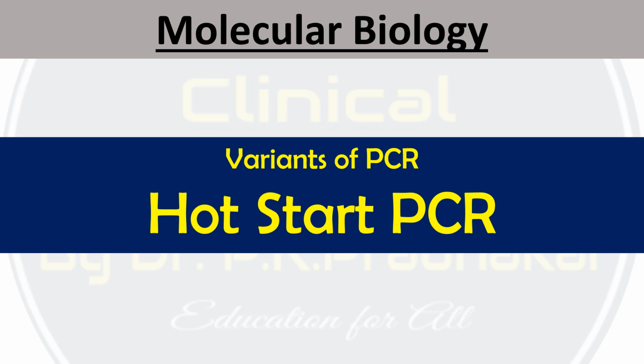In the series of variants of PCR, this is the third lecture where we are going to discuss the Hotstart PCR. We will see what exactly Hotstart PCR is and why we require it, and then later on we will see the advantages and disadvantages of this Hotstart PCR.